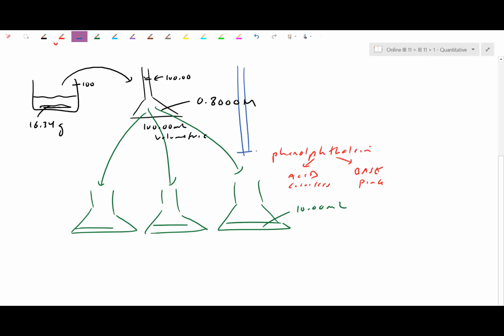I put my base in the burette. Remember, the burette here has a 0 mark up top and the 50 mL mark down on the bottom. I generally tell people to just fill this burette something more than half, and I'm going to give you what the VI, the volume reading at the beginning, was. After the titration is done, we took a VF reading, and it's actually the difference in volume that we dropped in. This one here was our about 1 molar NaOH, but our whole goal is to figure out this 1 molar to a little more precision.